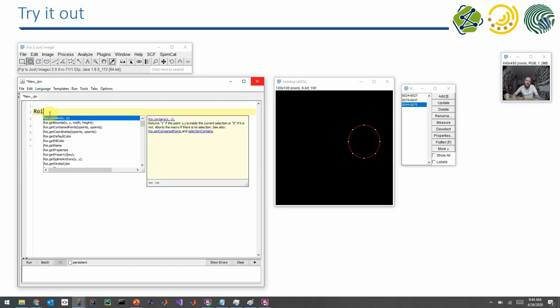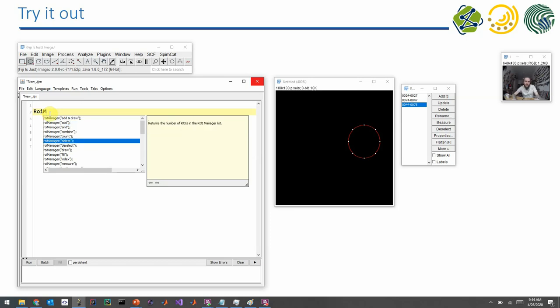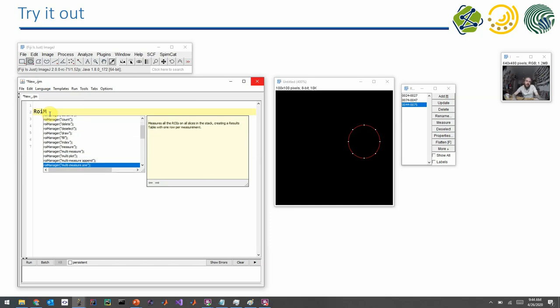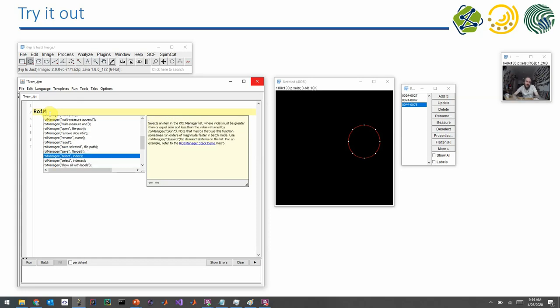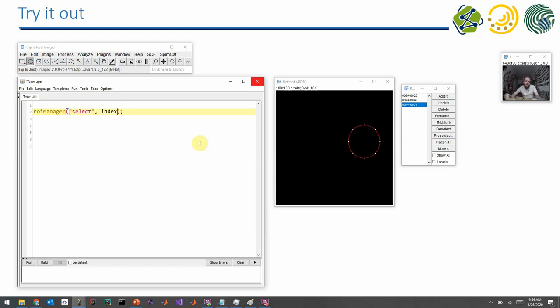And we can get this by selecting the right language and starting to type ROI manager. And you find here all the things you can do with an ROI manager. And there is, for example, one entry which is called select. And when you hit enter, you have the command there. And you can then, for example, say, OK, I select ROI number one.